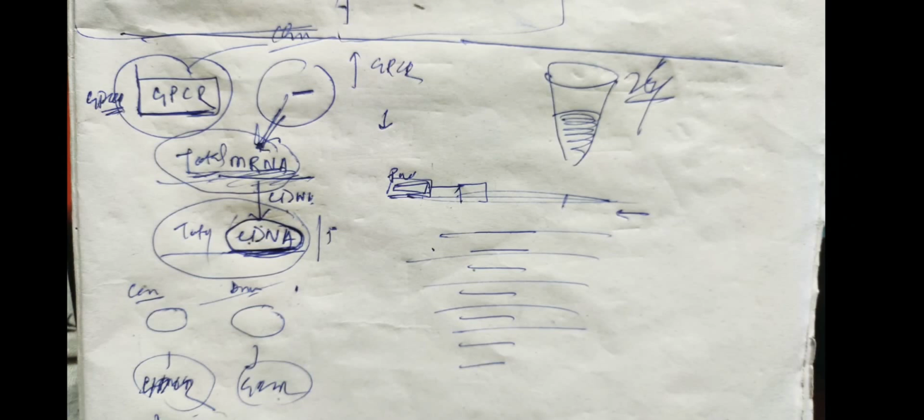As you can see, the primer has binding affinity only towards its respective complementary DNA, so it only binds to the GPCR-related gene sequence, and that will be replicated. By this we can know whether the gene for the GPCR is upregulated or downregulated in the presence of your drug, and you can compare with your control, that means in the absence of your drug.